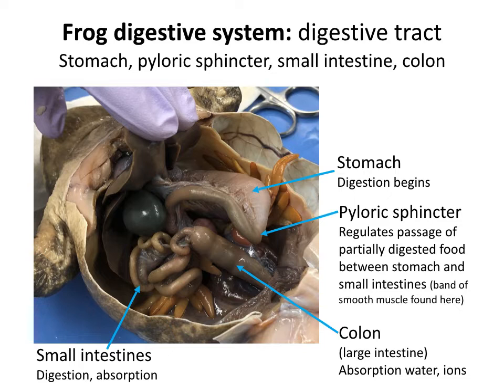In frogs, that is not the case. So in this picture, the heart and the lung are still anterior to the parts that have been dissected, so you can't see those yet. When you lift up the liver, that dark green thing on the left is the gallbladder, but we'll talk more about that on the next slide.